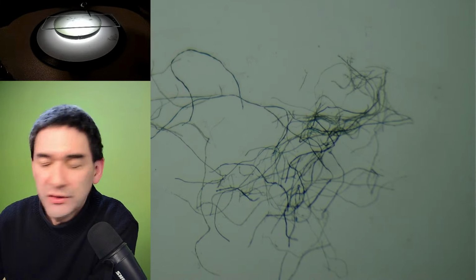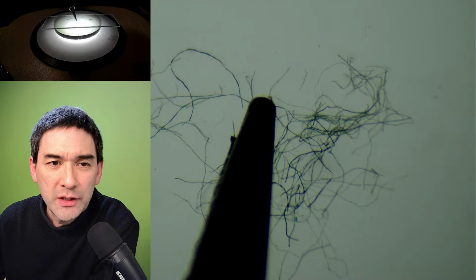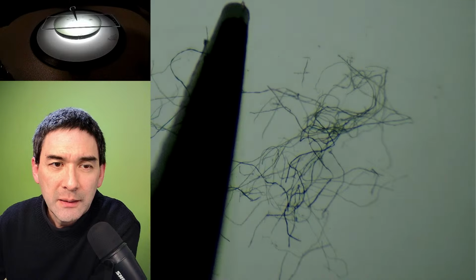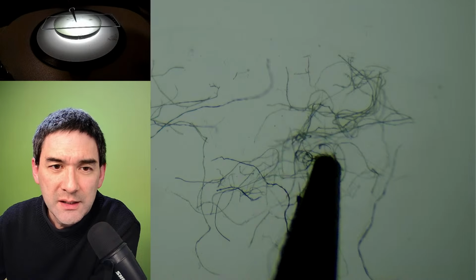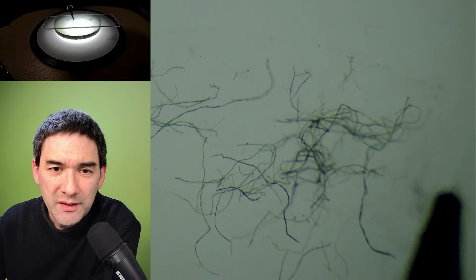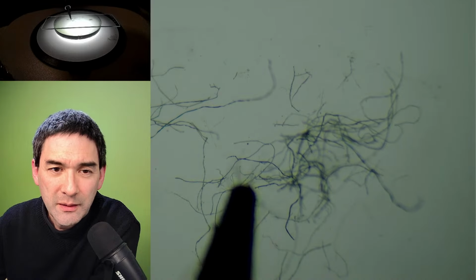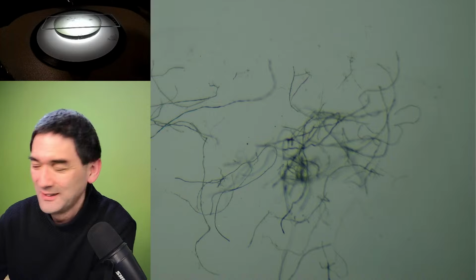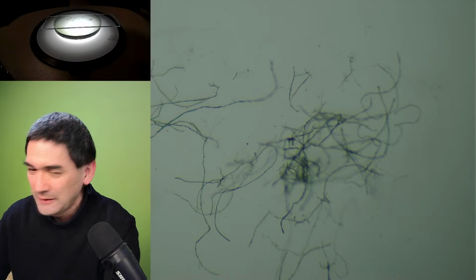And what I would like to do a little bit is optimize this and make sure that the tip is a little bit better. So maybe I'm going to file down the tip a little bit. This is actually also a nice experiment to do a little bit of citizen science: how much of the dust is actually made of plastic, so to say, of microplastic. I'll leave it here right now.